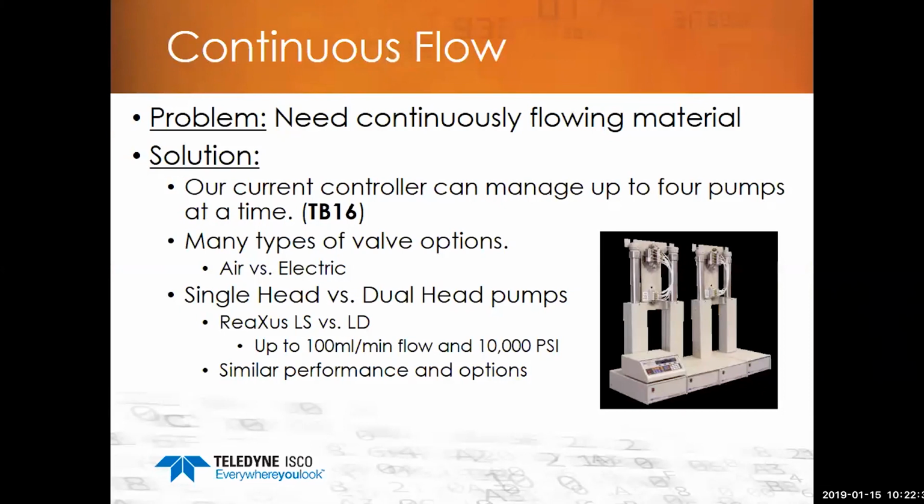You could do it for the other types of pumps, but you have to make sure they're connected together. You can see a picture here where we have one controller and 4 syringe pumps being controlled by one controller, and there are 2 continuous flow systems. So those are things you need to consider in your application, and how you set it up.